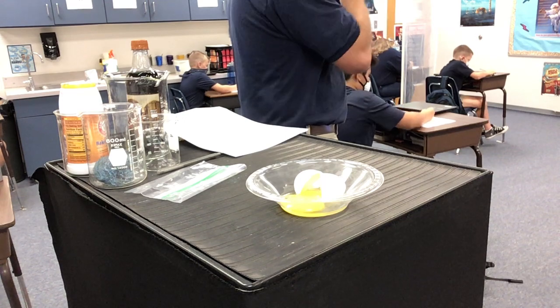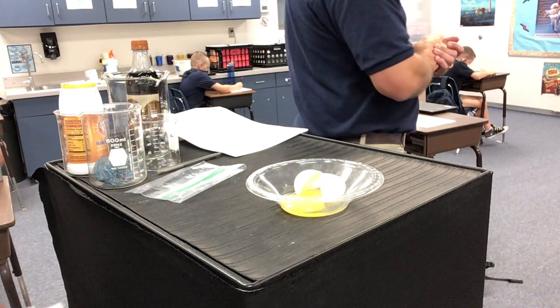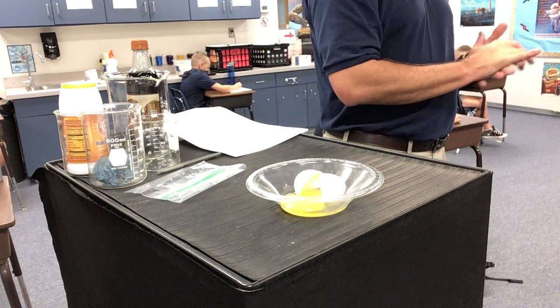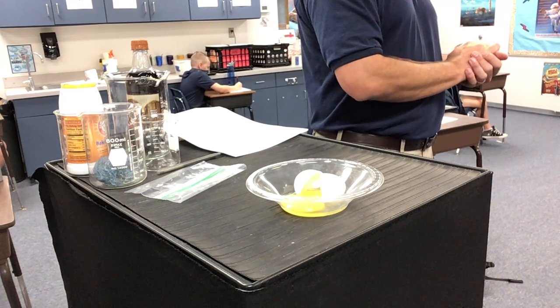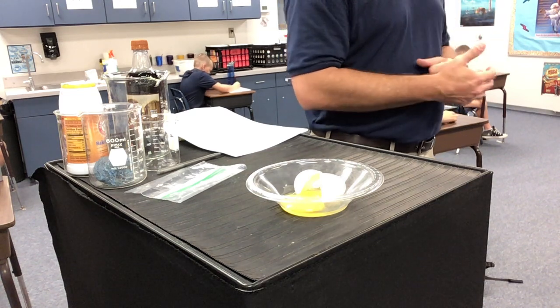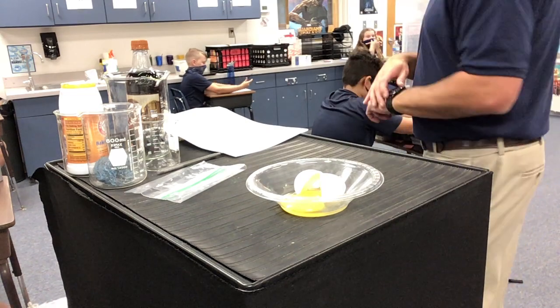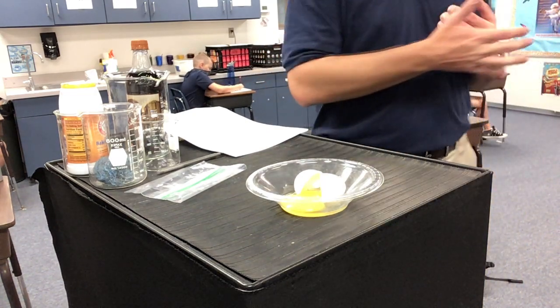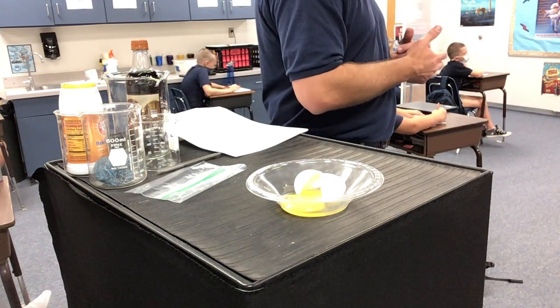If it made bubbles, put an X or a check there. If it has a different smell, put an X or a check there. If not, leave it blank. You should be able to fill out if it was a physical or chemical change, and then describe this. It is a physical change because this didn't happen. This is a chemical change because it did this, whatever.